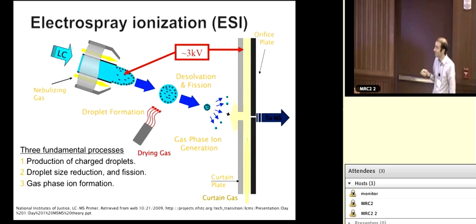Mass spec is sensitive and selective. It's got high resolution, and mass spec can help identify metabolites and can provide some structural information when the criteria are right. Just knowing the molecular mass of a metabolite is a very useful piece of information because that really narrows down what it is that you're looking at. It's useful for quantitation. As I said, we wouldn't start if it wasn't, but the sources of interference must be carefully managed. You have to really know what you're looking at, and we'll talk more about that in a bit.